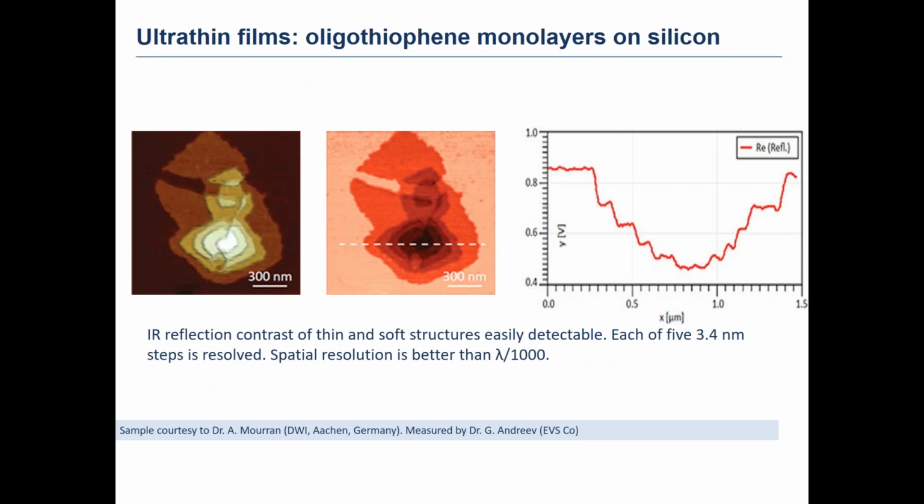The next question: is it possible to use my own infrared source? Well, it depends on what kind of infrared source it is. Actually, for the scattering SNOM regime, we need constant wavelength, a constant light source. For the AFM-IR regime, where the mechanical response is measured, a pulsed laser can be used. So it actually depends on what kind of sources exist.